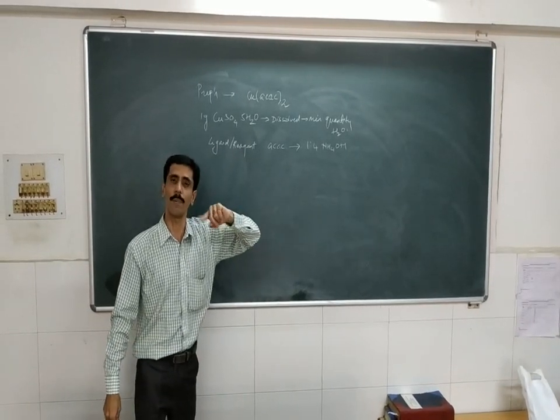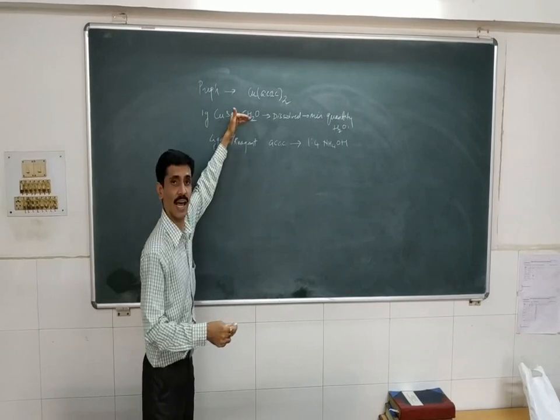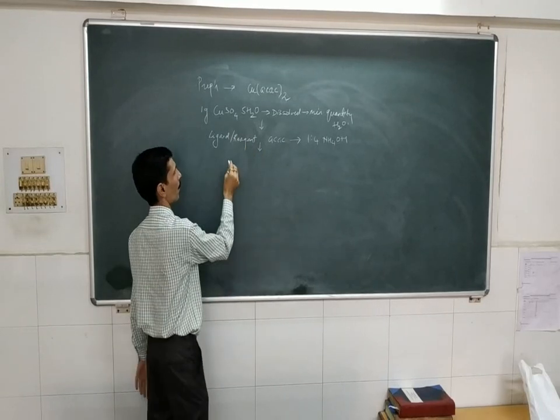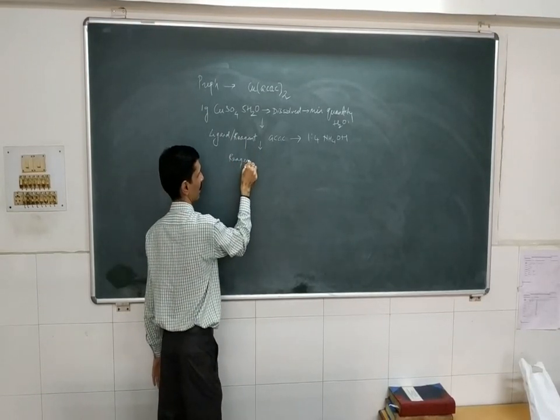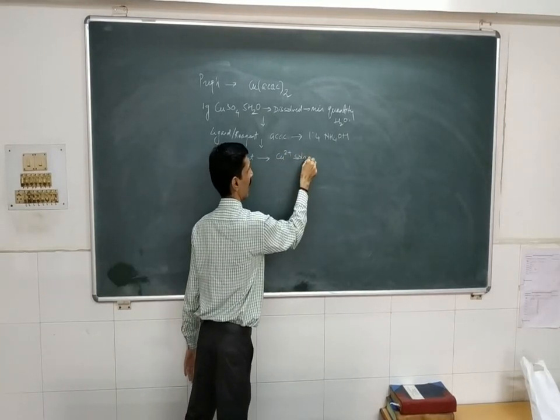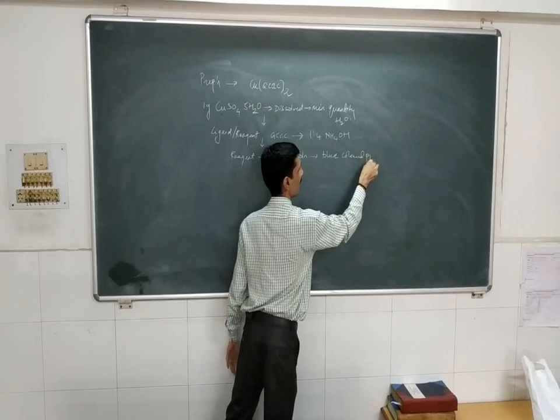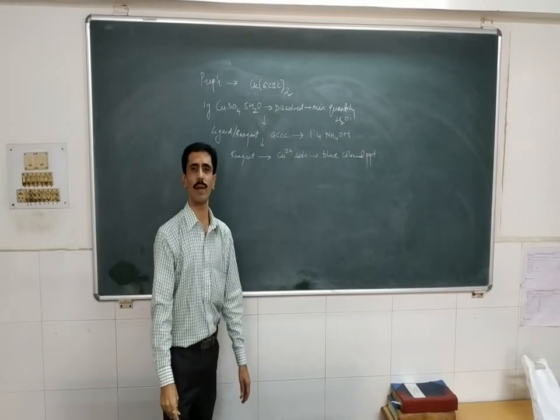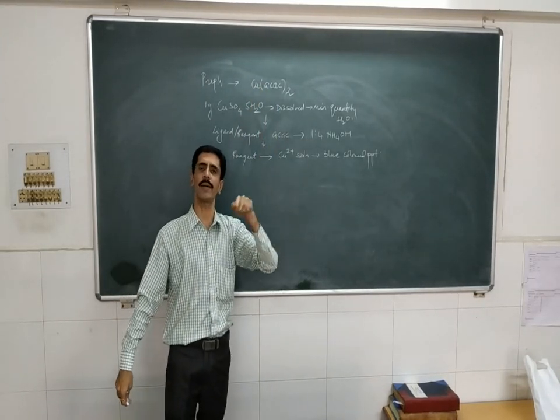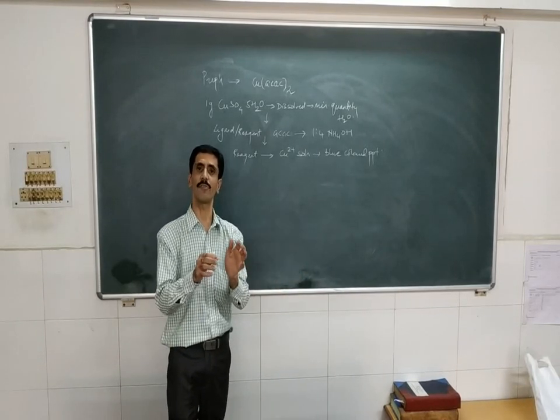Complex formation involves bonding between a metal ion and a ligand, so obviously both these solutions have to be mixed with each other. Step number 3: to the copper solution, the reagent is being added. The ligand solution is added to the copper sulfate solution, and that results in a blue color precipitate forming. However, this is not a simple reaction where we get only one product — there will be some side products or by-products in soluble form, and the precipitate is uniformly distributed.